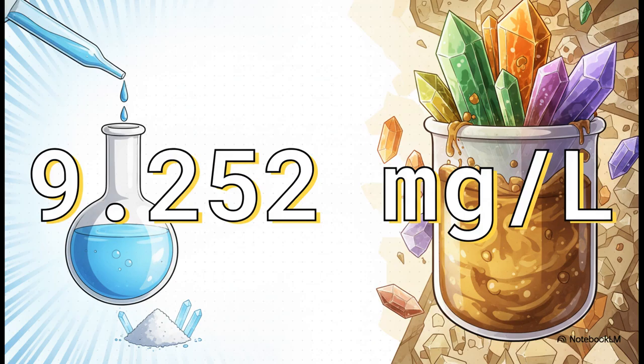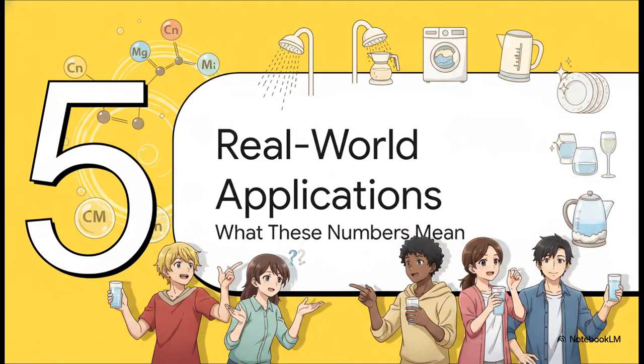That's an incredibly low number, which makes perfect sense for reverse osmosis water, since the filtration membrane is literally designed to strip almost all the minerals out. But to put that 9.2 into wild perspective for a second, when Dr. Chem ran this exact same titration procedure on a regular tap water sample, the results were astonishing. The tap water didn't require a tiny 0.3 milliliters of EDTA, it required so much titrant that the final calculation hit a shocking 427 parts per million. No way, right?